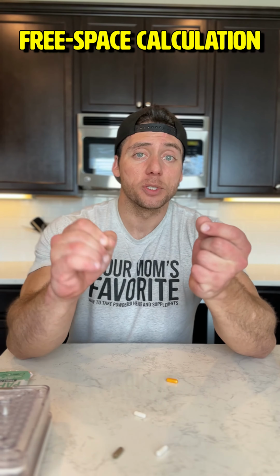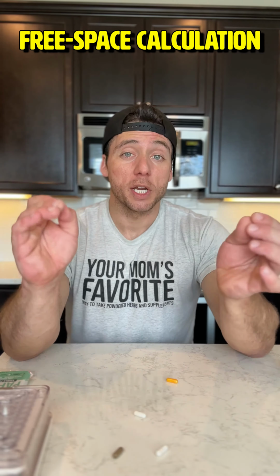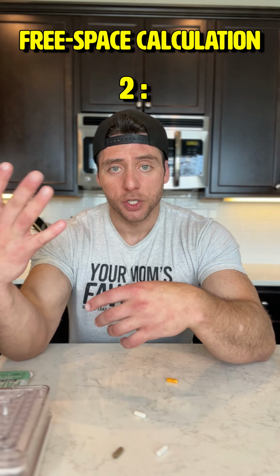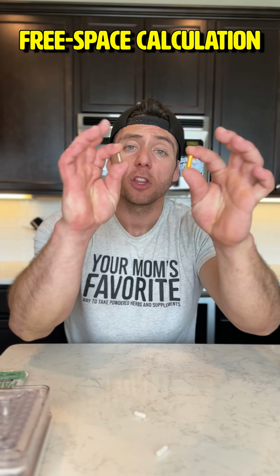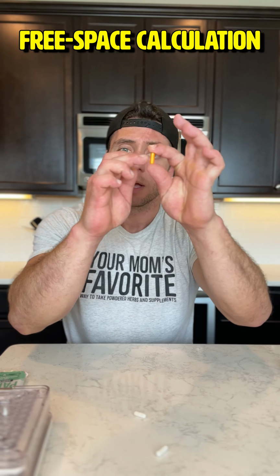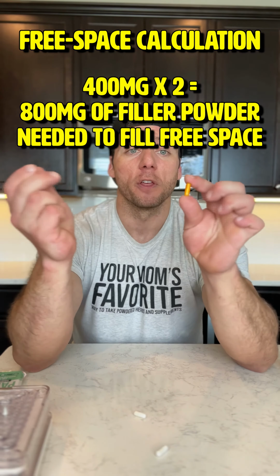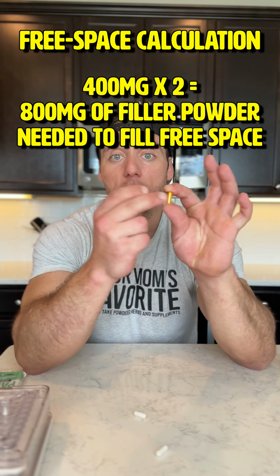So we know that one capsule can hold 1,000 milligrams of filler and 500 milligrams of the main substance. So the ratio of filler to main is 1,000 to 500, which is 1,000 divided by 500 is 2. So it's 2 to 1. Now all we have to do is determine how much filler powder it's going to take to fill up the free space left after we put in 100 milligrams of main substance. So 400 milligrams times 2 is 800 milligrams of filler powder is required to fill the free space left after we put 100 milligrams of main powder in this capsule.